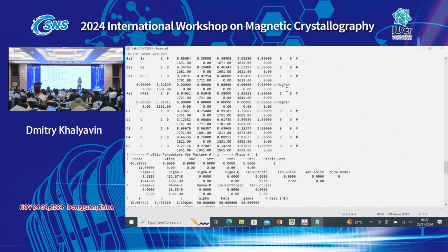And then when you normalize the data, for me, it's impossible to correct that. You can put in a more complex absorption correction, but it's just something for fitting a little bit better. This is really a problem. Yes. I don't know if you have seen the recent paper by Bob Von Dreele, just converting the time of flight to constant wavelength. Using, for example, in EXPGUI or a plotter, if you put Q, then you say I have one single wavelength, and then you convert to 2 theta.